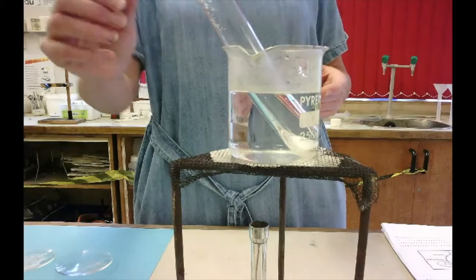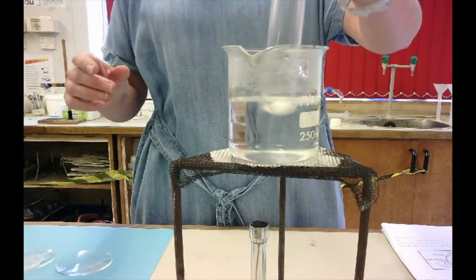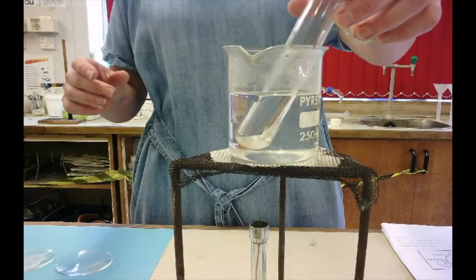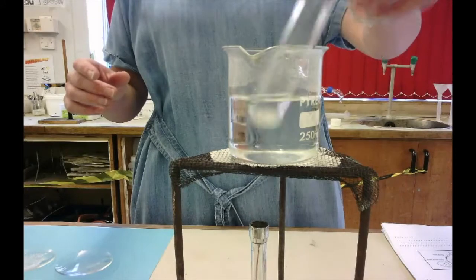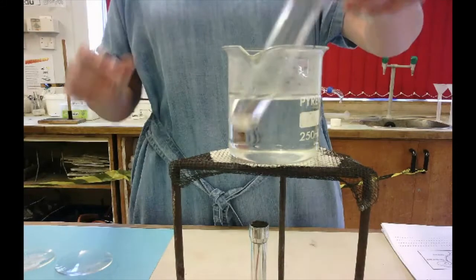I've knocked the Bunsen off now, but we've just got boiling water in there. I'm going to swirl this around so it melts a bit more quickly, and you can see that the salol is melting.